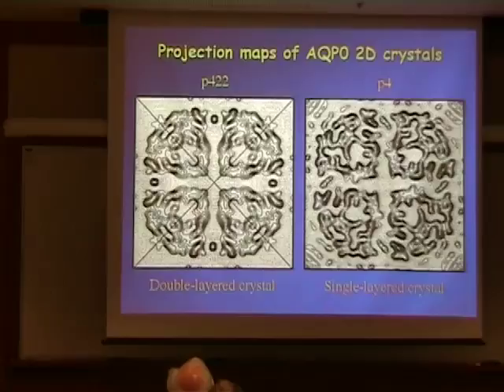And as you heard this morning, we are actually not able to have this in one protein. So what this means, the only way that we can get this is if you have 2 tetramers sitting right on top of each other. And this actually introduces this real mirror axis here.